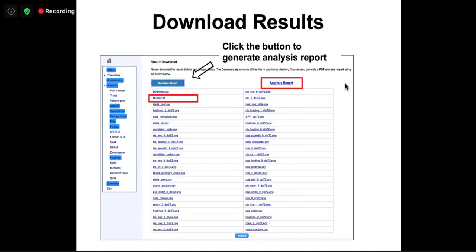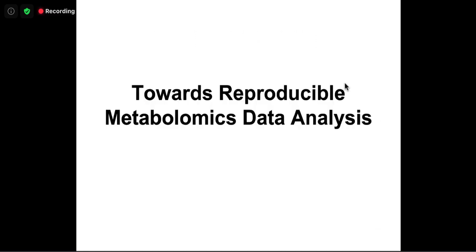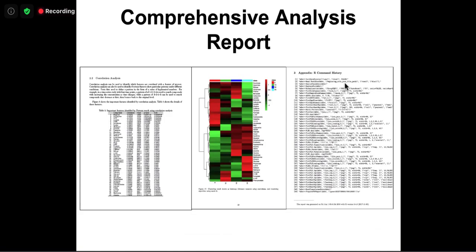This feature is important because so many people are using MetaboAnalyst, and we want them to capture the parameters and reproduce the analysis. Also, MetaboAnalyst is evolving gradually, so we cannot afford to keep all the versions available. The best approach is that we give them the best version. If they want, they can freeze their R package locally. What we talk about is more cutting-edge research, but the core is always stable, so we keep compatibility in mind.